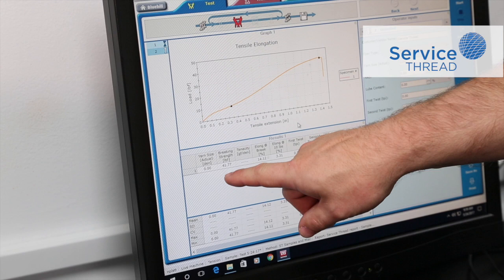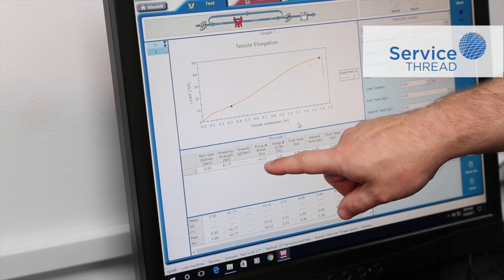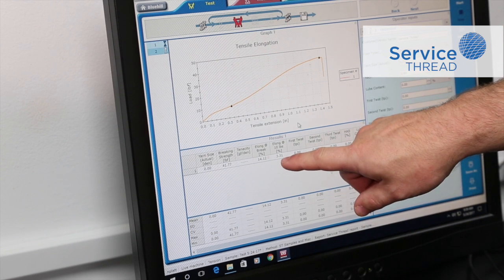Breaking strength in pounds, elongation at break in percentage, as well as other options such as elongation at 10 pounds.